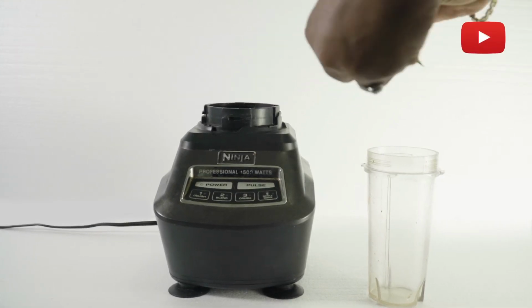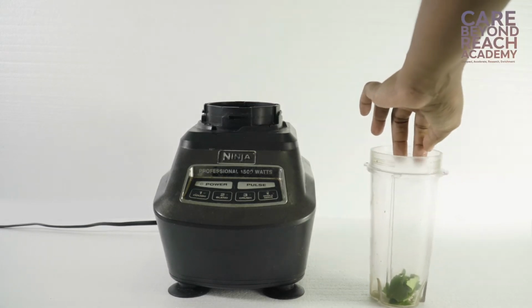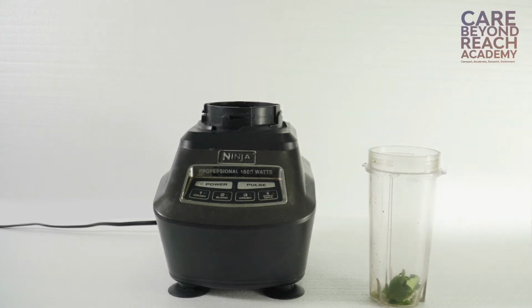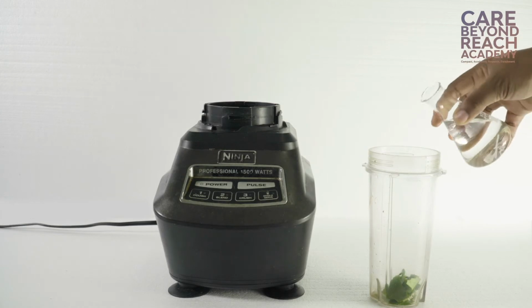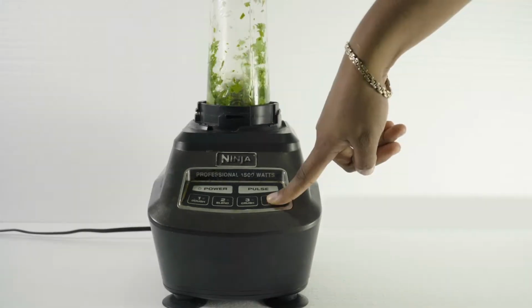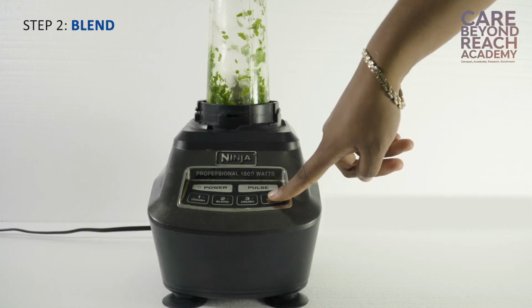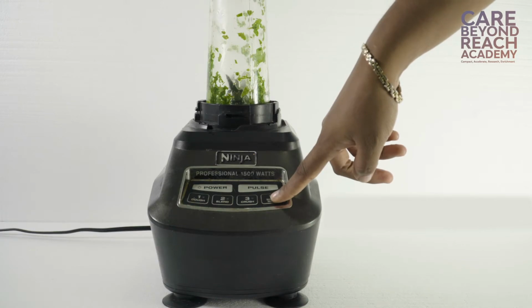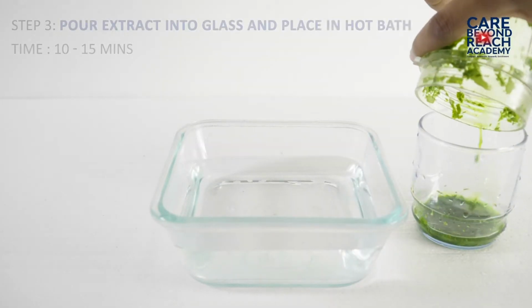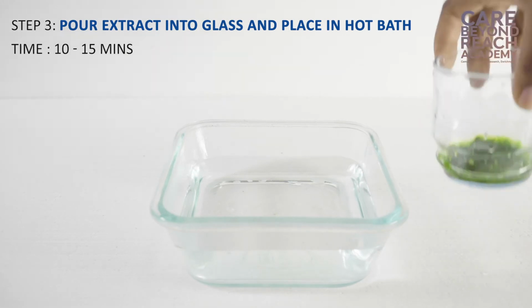Here we are tearing the leaves into bits and pieces so that we can actually have more surface area and room for extraction. So we will simply tear the leaves, pour the alcohol on the leaves, then we go ahead and blend. As soon as we blend and have extracted a suitable amount of the chlorophyll, then we can simply go ahead and pour it into a glass, place in a hot water bath to speed up that process.